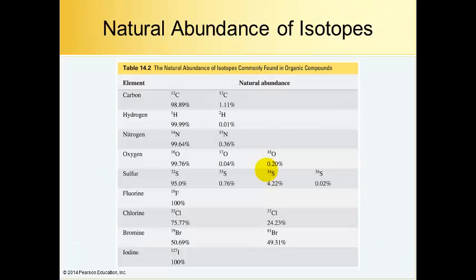Now, in order to do mass spec properly, we really have to talk about isotopes, because mass spectra instruments are very precise and they give us very detailed molecular weight or mass information. The incorporation of an isotope in the molecule is definitely going to affect the spectra. For carbon, for example, 1% of the carbons in naturally occurring compounds is carbon-13.